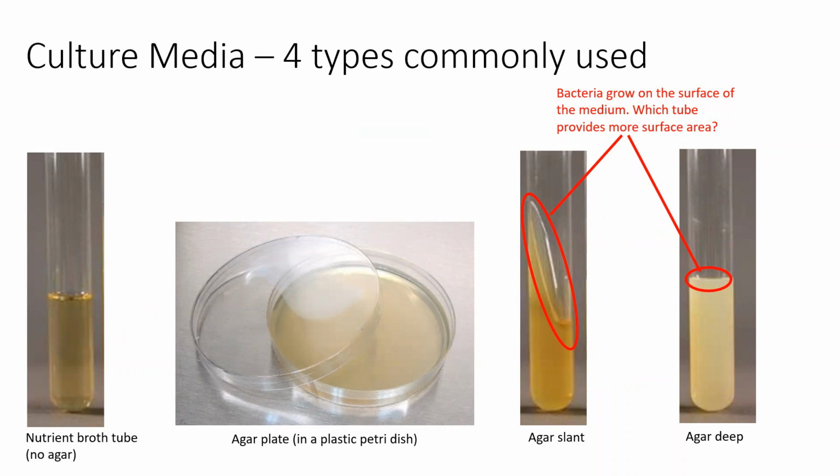Okay, so agar, being a liquid at really high temperatures, gives us the flexibility and the ease of pouring this nutritious medium into test tubes or agar plates. So it makes making media a lot easier. But then again, as it cools, it solidifies. So again, agar is a solidifying agent.